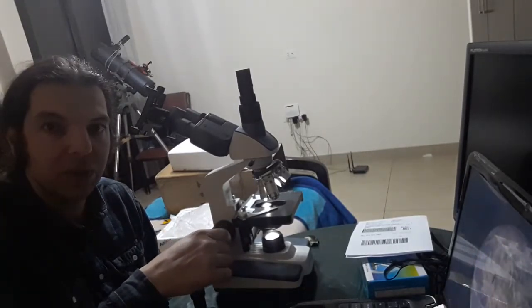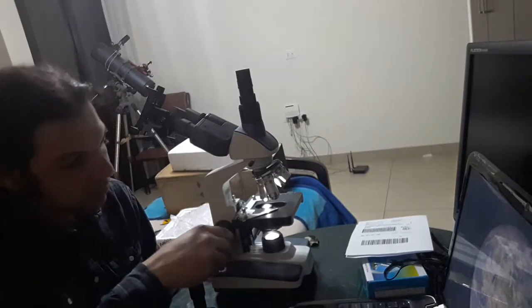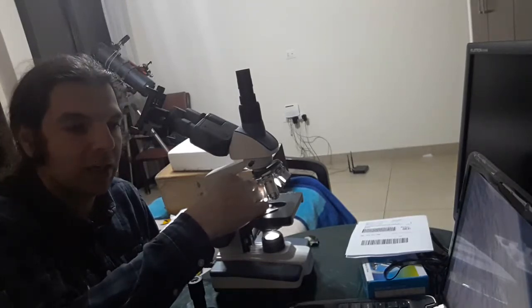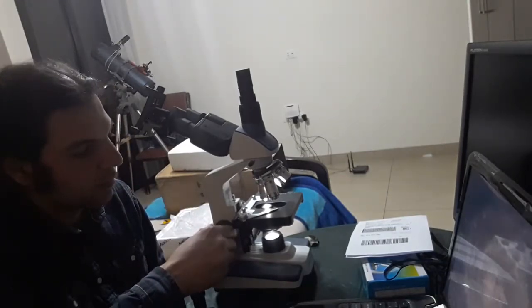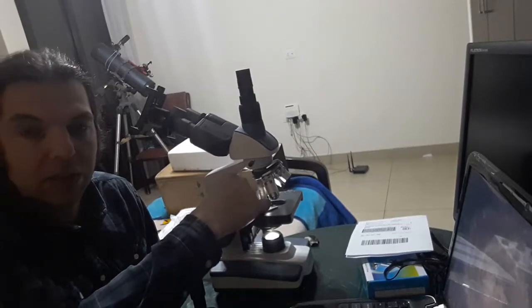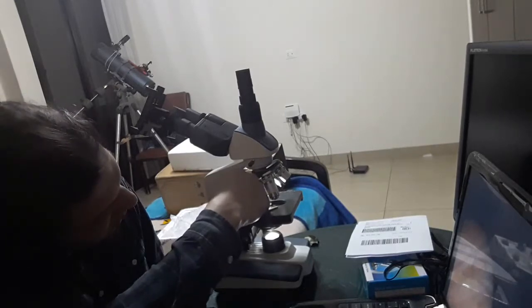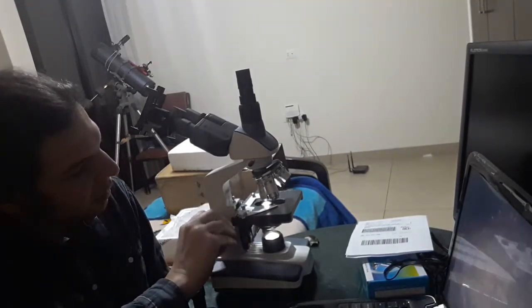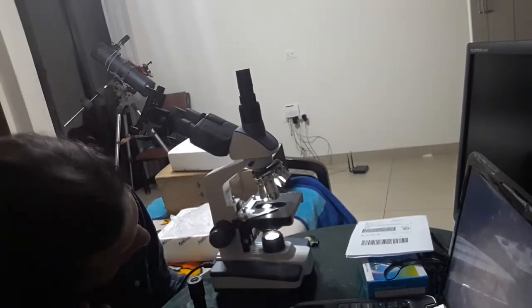You can adjust the screw so the stage can move more freely, as much as you want. You can also lock it in order to prevent it from moving further.